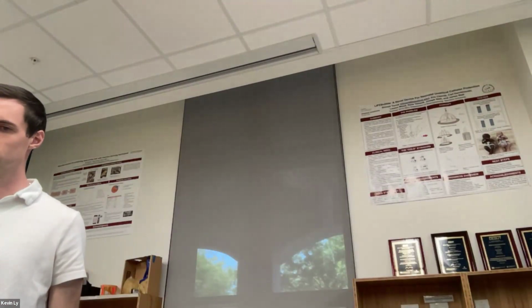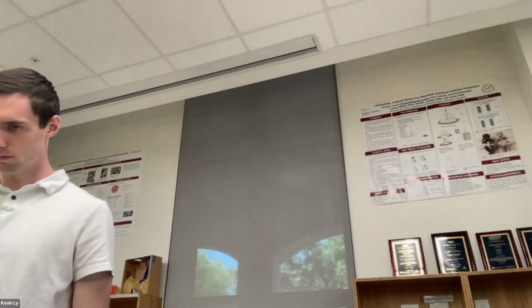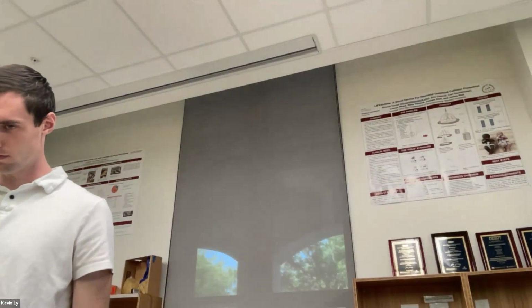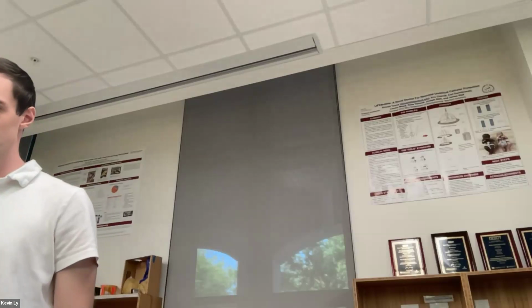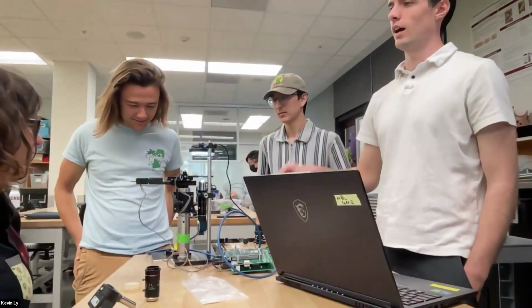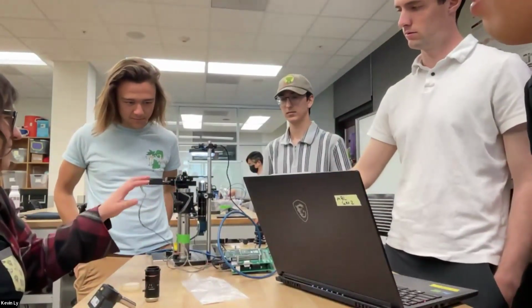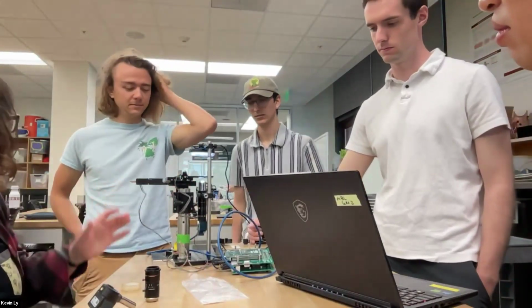Is a motorized stage sufficiently expensive to justify designing and making all these parts? I'm sure it is quite expensive. Do you have a stage from a company? Yeah, I guess something like that. The price point does go up, I'm sure, like an order of magnitude. I think there's a bunch of different open source methods that people have used to make similar stuff.